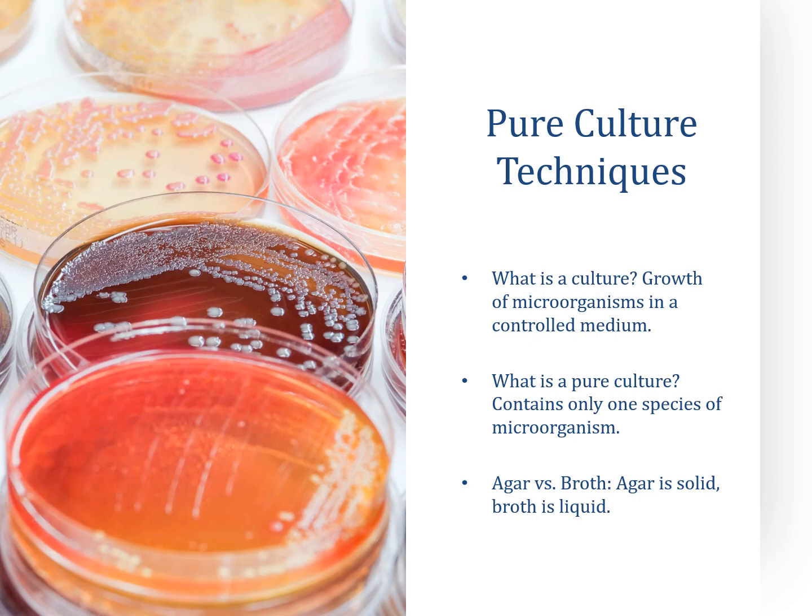So what is a culture and what is a pure culture? A culture is when you have medium, an agar plate, and it's inoculated with organism. And then a pure culture is the same, but it's only one species of an organism. So, for example, if you inoculated EMB with E. coli and there's no contamination, that would be a pure culture.